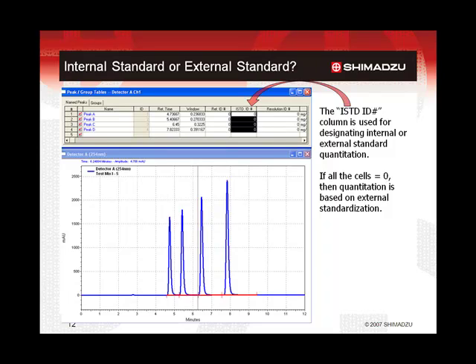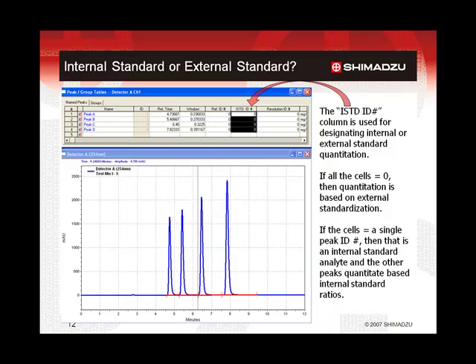If the quantitation is to be by internal standardization, then a material — the internal standard — is added that does not match any of the peaks in the analysis. This material is added to all the calibration standard mixtures, usually at the same concentration in each mixture. This creates a concentration ratio of the intended analyte to the internal standard material. The response factors are based on the ratio of the concentrations to the ratio of the peak sizes. To set the method for internal standard quantitation, the internal standard peak must be designated, as well as which peaks will be using that internal standard. In the example shown, if all of the internal standard ID cells were set to two, then peak B (ID number two) will be the internal standard peak, and peaks A, C, and D will be ratioed to peak B for the internal standard calibration.